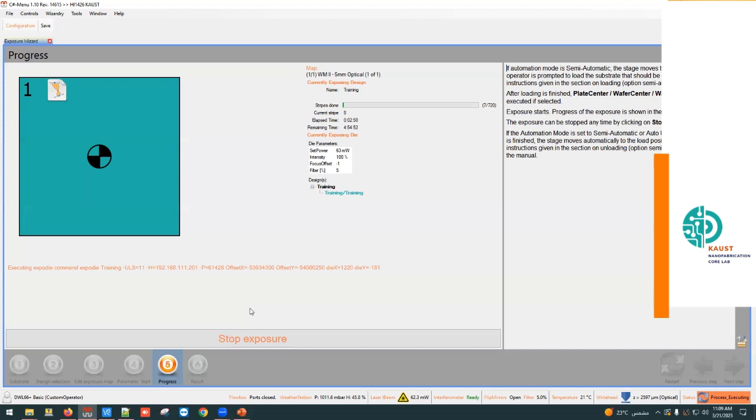It will come later on. You need to be an already experienced user, because this is critical. You can break the system if you don't realize you have the wrong chuck. I mentioned in the email that this is a training for single exposure.